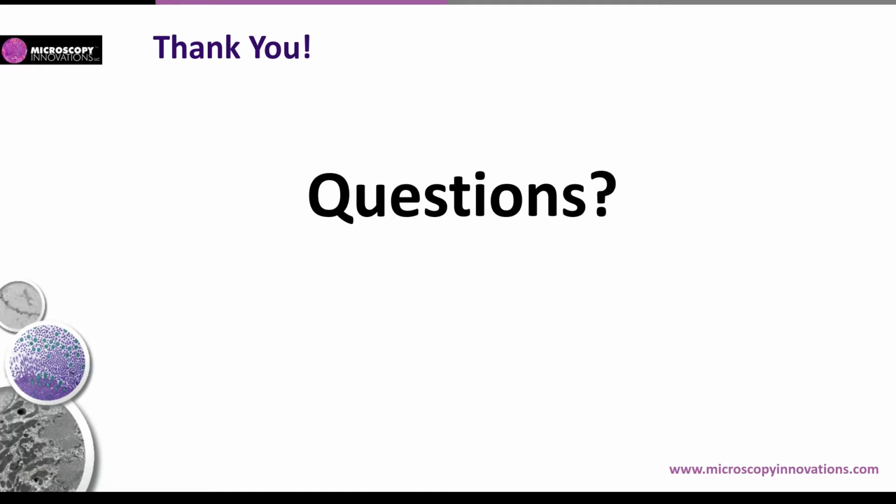Thanks so much, Tom. Tom, while you're on, this is Steve Goodman here. A question came in asking about heating stage, heating and cooling. Can you answer that? I think that's probably a better question since Emily mentioned it. You betcha. The question was, can you heat up the plates for processes when the chemical solution needs to be used warm?